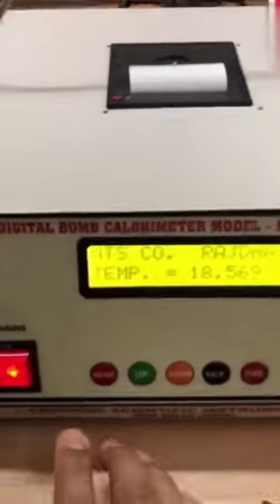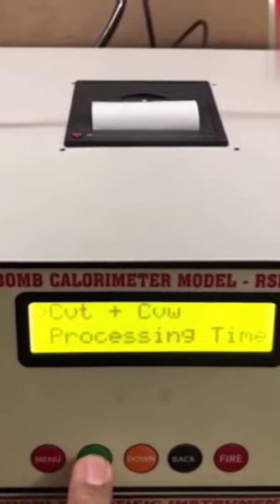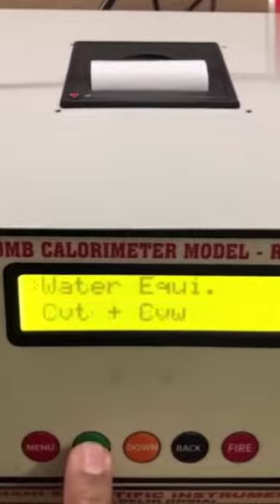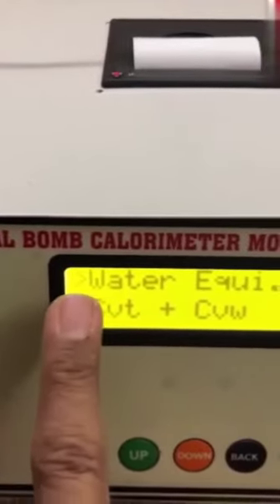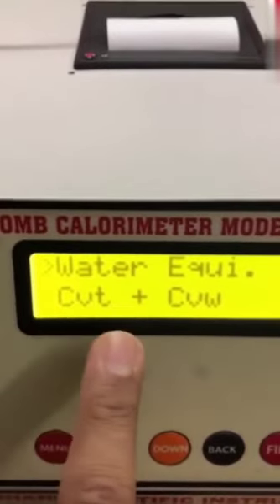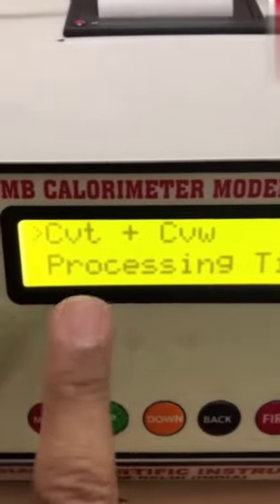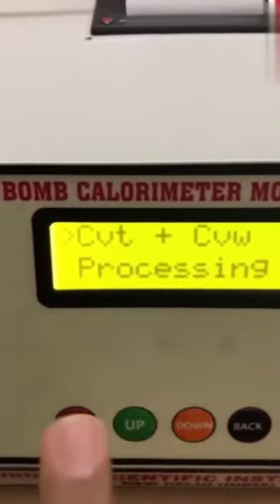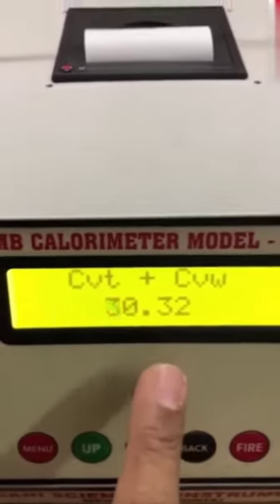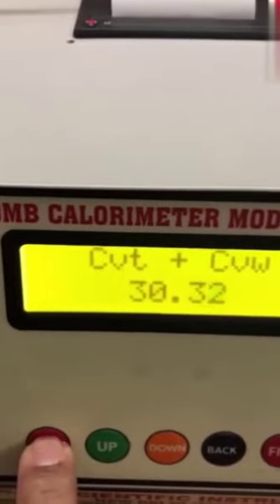If I press the menu button, this is the option page — there are 4 options: water equivalent, CVT plus CVW, processing time, and memory. These rotate in cyclic form. The first option is water equivalent, and there is an arrow showing this option is selected. Suppose I want to work on CVT plus CVW — I have to bring this option to the first line by pressing the up button. CVT is calorific value of thread; CVW is calorific value of wire. I press the menu button to go inside — it is showing CVT plus CVW: 30.32. Always remember that this value should remain the same for every test.